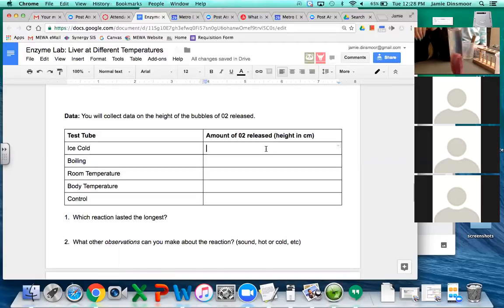Okay, nothing happened. It looks like one of those weird jars that people have in their house. Great gift idea. Chicken livers in a jar with water for all the people in your family that like weird stuff. Happy holidays, have some chicken livers. Okay, so that was our control. Obviously, nothing happened, right? That's what nothing happening looks like. We poured water on liver.